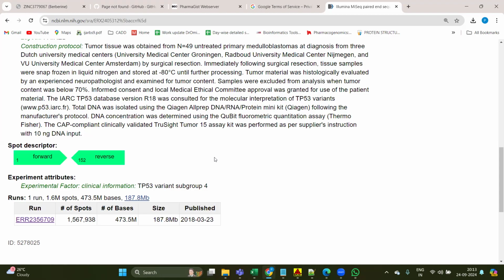Okay, so in such cases, we will require two input files, and as the SRA will only give you one file, you have to follow a lot of steps to separate out those data. Okay, and it's a bit tedious process to separate out the forward and the reverse file.